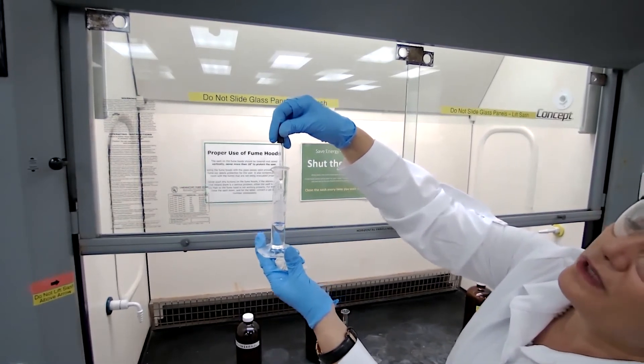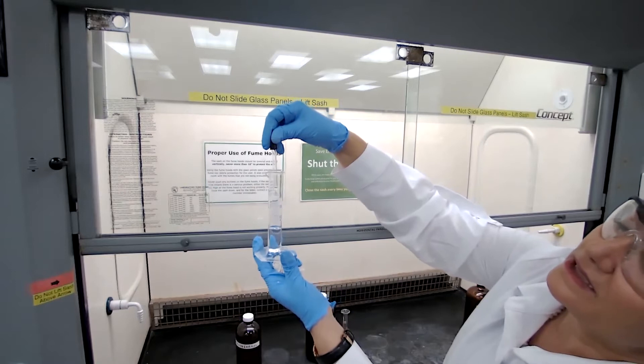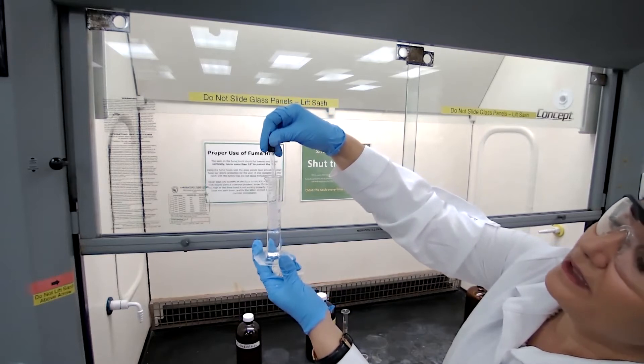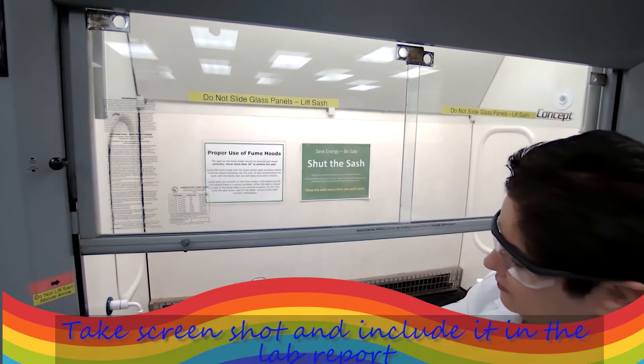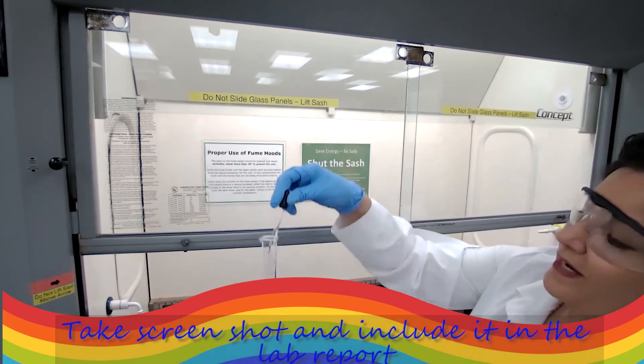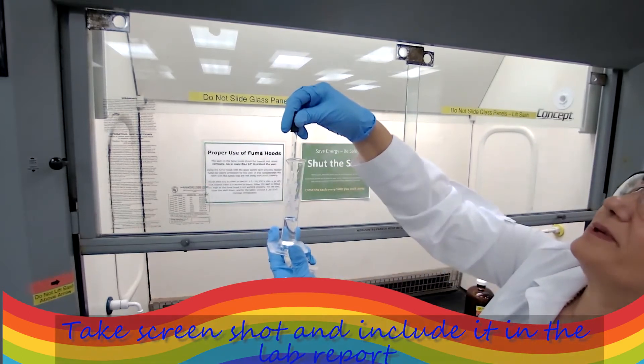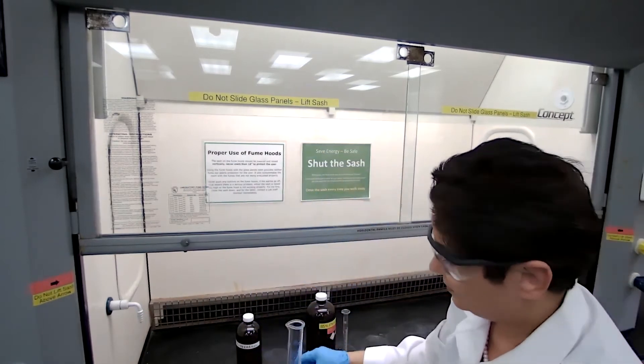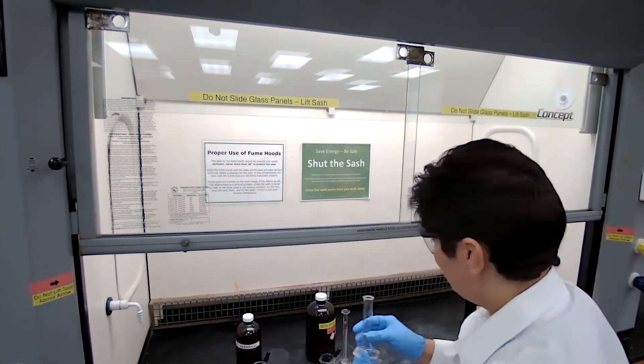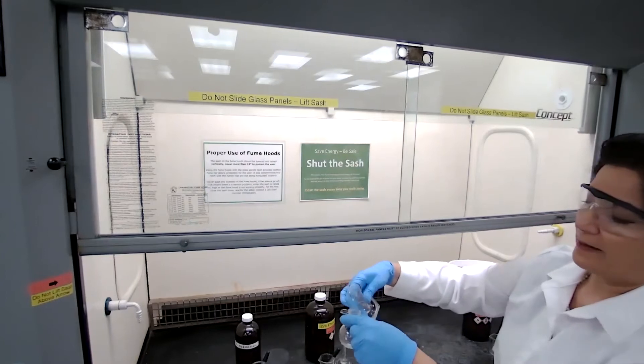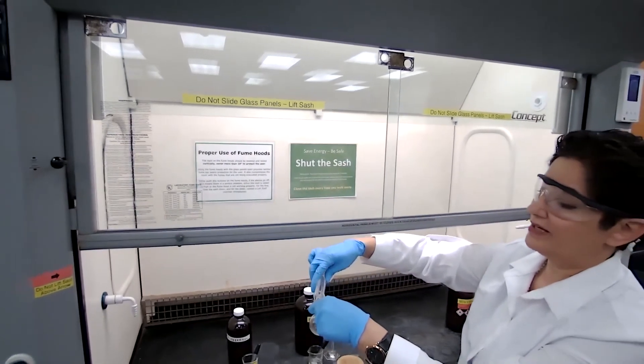We are looking for the meniscus to reach the 10.6 milliliters. I don't want to add drop by drop from the beginning because that would take a long time. Pour that into our boiling flask.